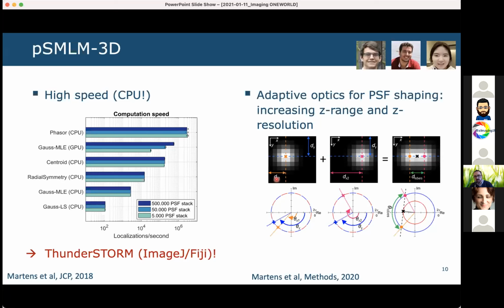So let's look at the left picture first. As we said before, the position is given by those two angles, so the position of the single dot over here. If you now have a second dot, so we convolve that, then one of the angles would stay the same, but this angle would shift because we have a different localization. What we now measure, however, is the convolution of those two dots. That means we have a feature which is long along the x-axis, which then is short in the Fourier space. So if you use the radius that we have for the long feature and the radius for the short feature, then we can use the inverse tangent to calculate the positions of those two points and the position of that one.